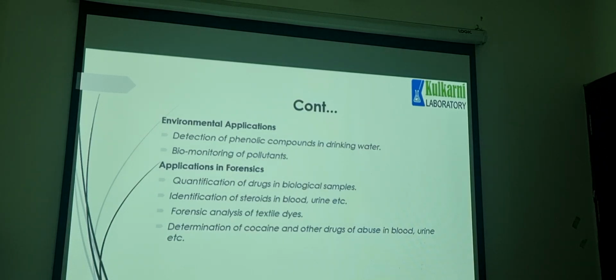Then what other applications are there? Forensics. Forensics for quantification of drugs in biological samples, identification of steroids in blood, urine, etc. Then forensic analysis of textile dyes, and determination of cocaine and other drugs of abuse in blood and urine, etc.